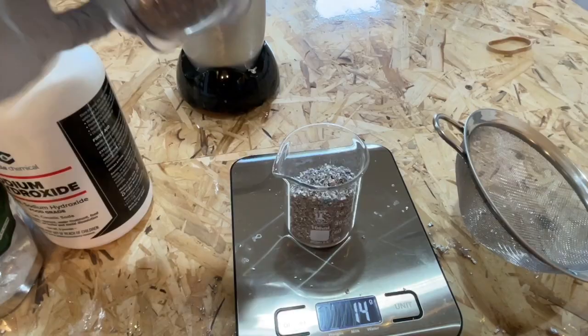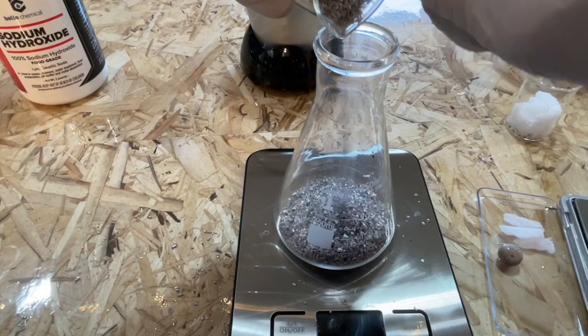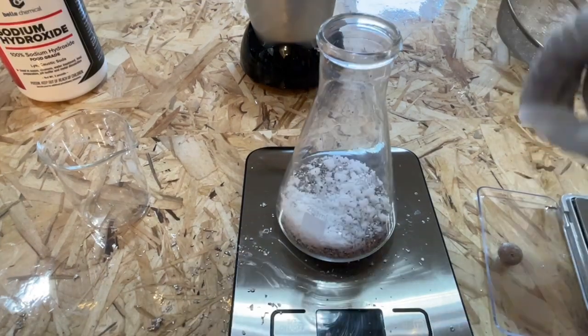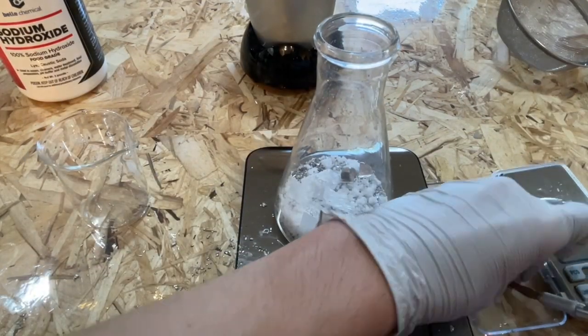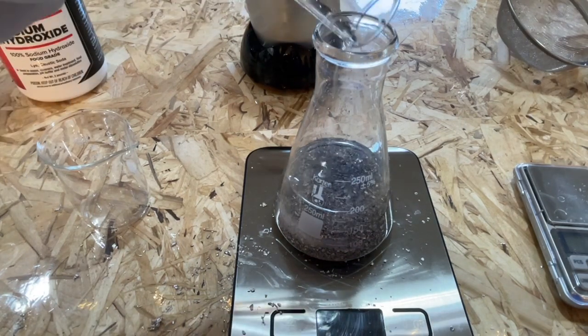I then added 14 grams of the coarse magnesium shavings to a 250ml Erlenmeyer. On top of this, I added the sodium hydroxide, the menthol, and the sodium. After that, I added 160ml of mineral oil on top of all this.